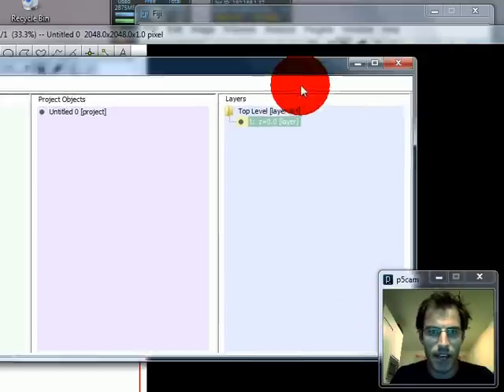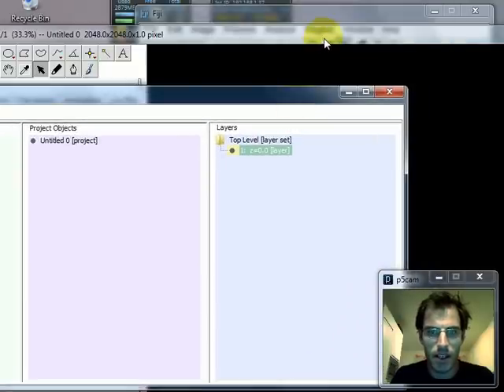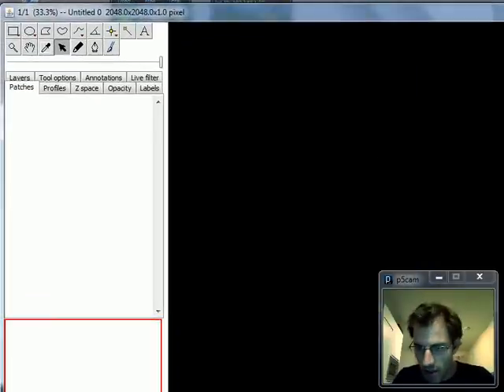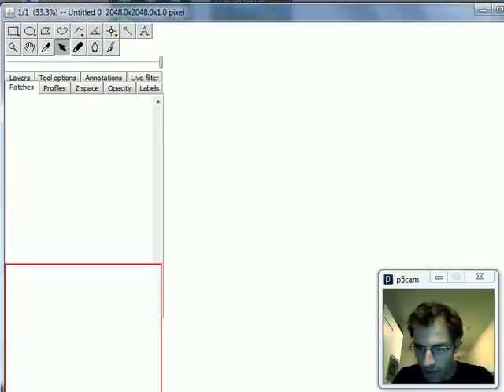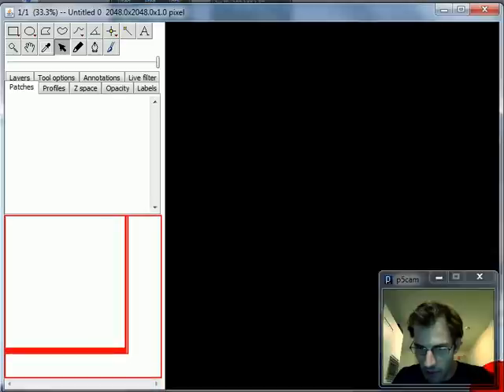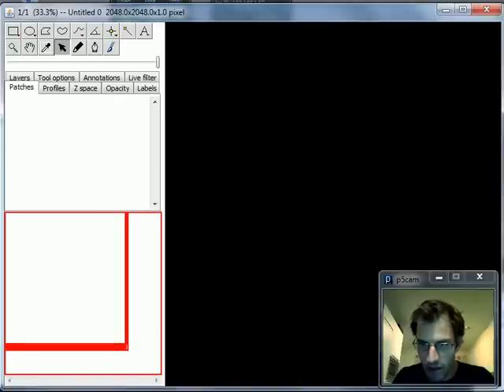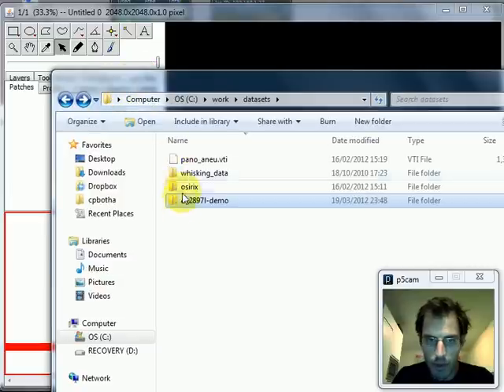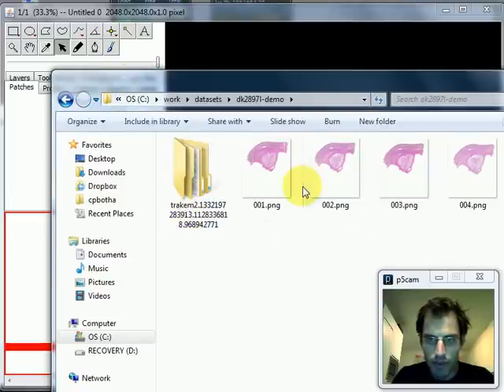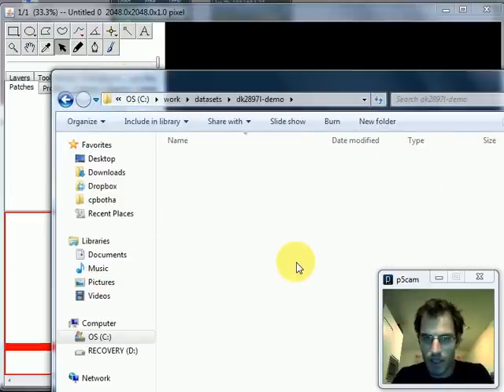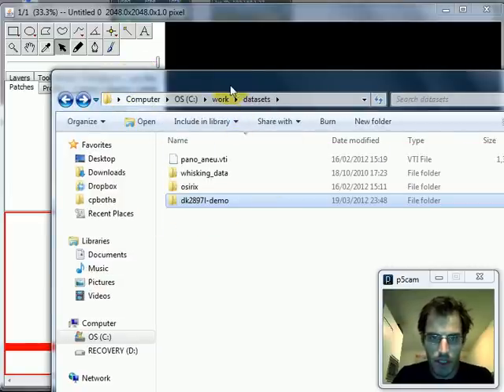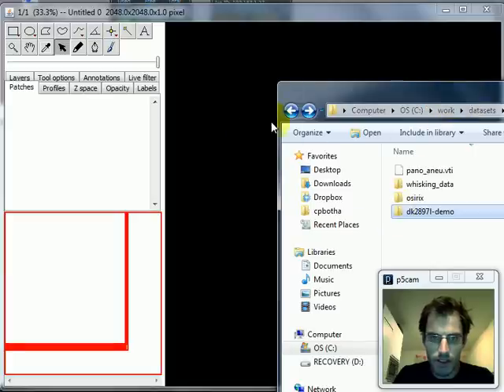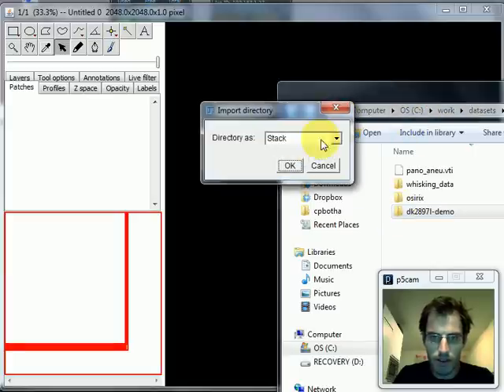So I get this canvas window that I can use. Let me just resize it so it fits within my capture range. And now I will drag and drop a directory that's filled with slices. You can have many more of course. I will drag and drop that directory onto the canvas.